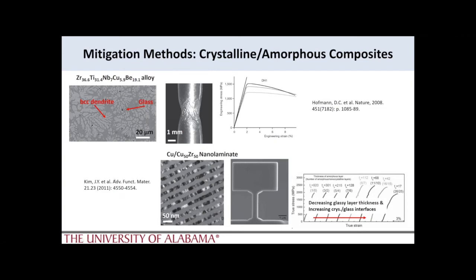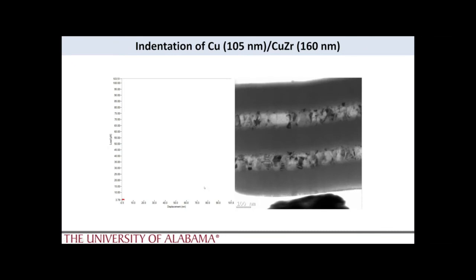This is a paper from Kim and others, who made these multilayers and did various tensile testing of the materials as a function of the layer spacings. What we've been able to do, or continue to do, is make a similar multilayer, as you can see here, and we wanted to understand that deformation in real time and correlate it with PED, particularly understanding the crystalline response, because PED is based upon electron diffraction.